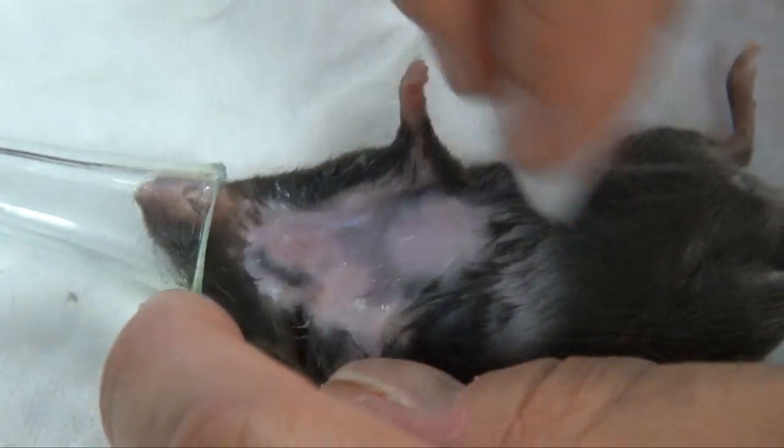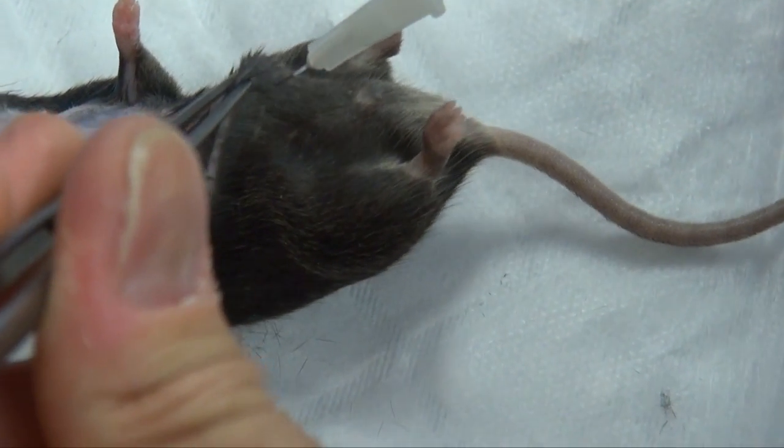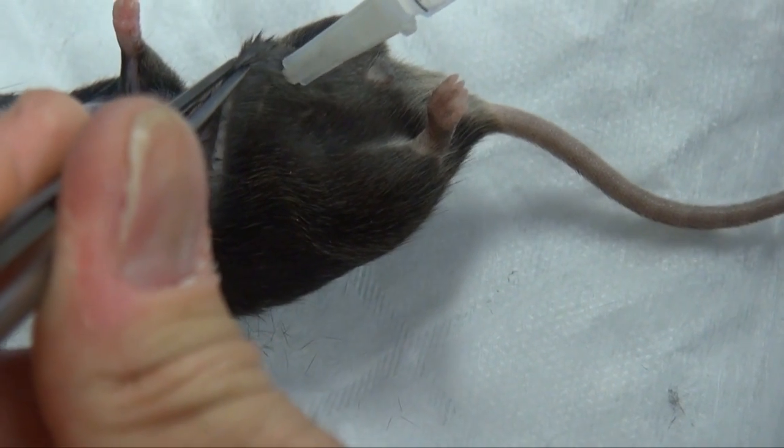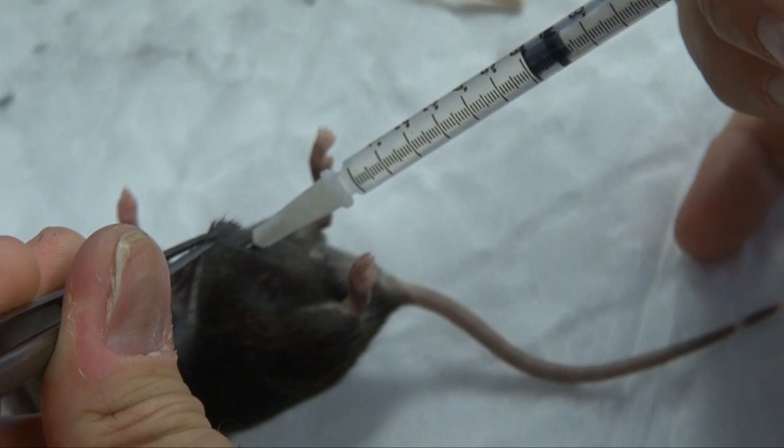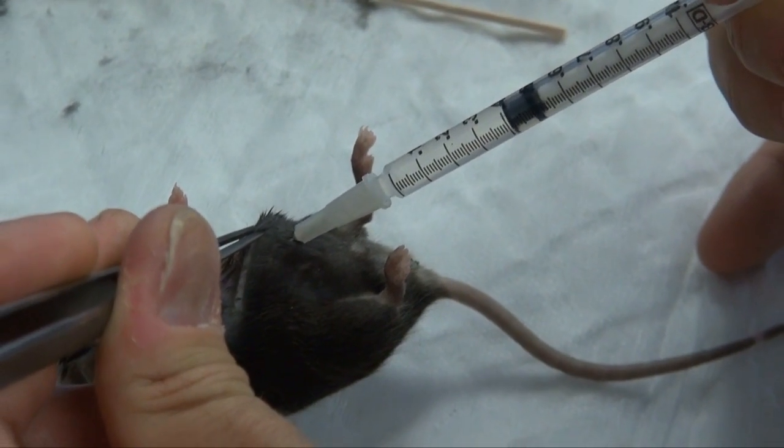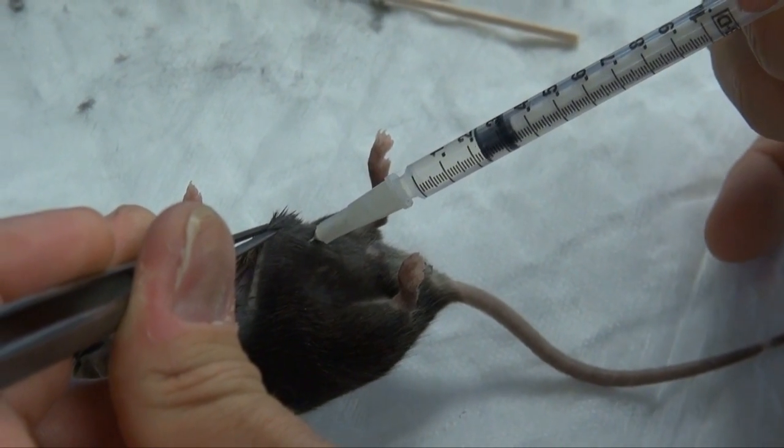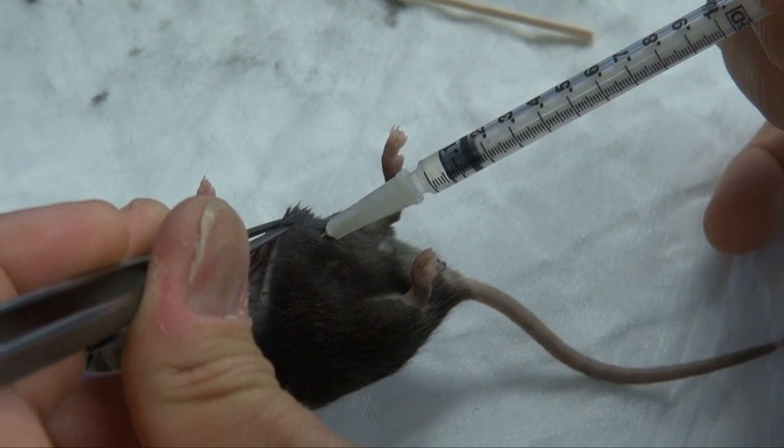Inject 1 mL of saline intraperitoneally by grasping the abdominal skin and subcutaneous tissue with forceps and sharply entering the peritoneal cavity with a 25 gauge needle. After intraperitoneal injection, allow animal to recover for 4 hours.